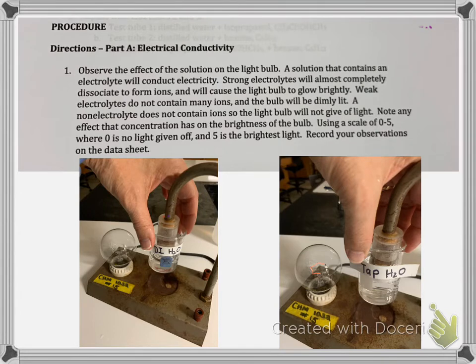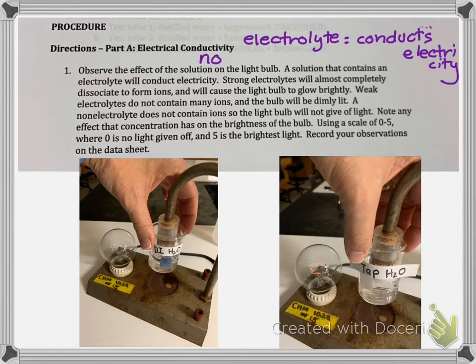It's called electrical conductivity. So we're looking at how different solutions can conduct electricity. And substances that conduct electricity are called electrolytes. And then non-electrolytes do not conduct electricity.